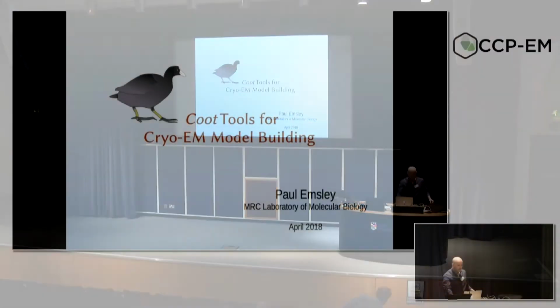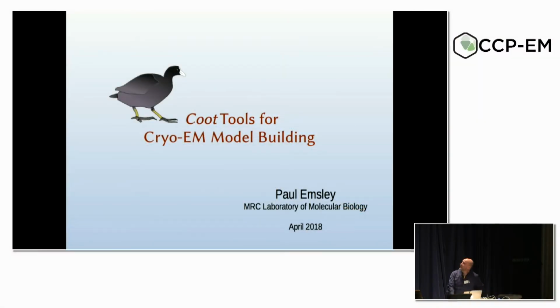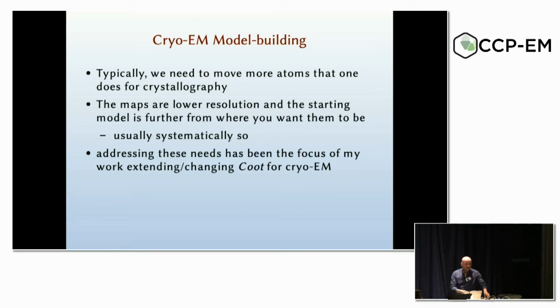I have 60 slides to do in 10 minutes, it seems. Okay, so Coot is a program typically used for crystallography historically. Now it's being used for Cryo-EM. As such, the way in which you use the tool is different.